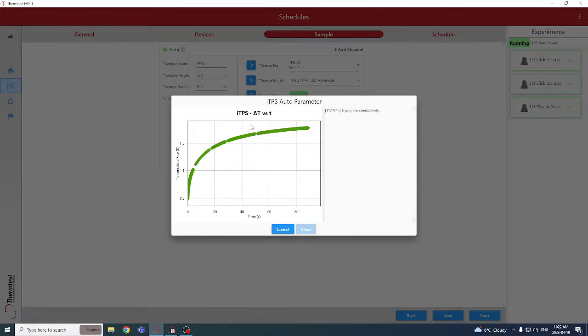So if you were to select the wrong conductivity out of that grouping, it will automatically change to a different conductivity range. So if I don't know what the conductivity range of this is, and I were to select the very low conductivity, it would know, based off the power range that's available in that particular category, that you haven't achieved it. So it would actually move to the next category automatically. So it's done. It wants us to do 40 seconds with 9 milliwatts based off the dimensions of that sample.